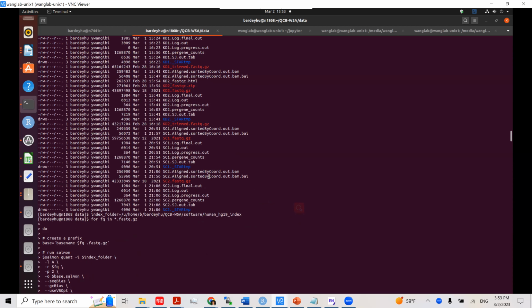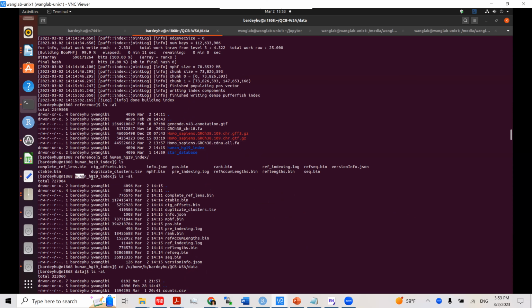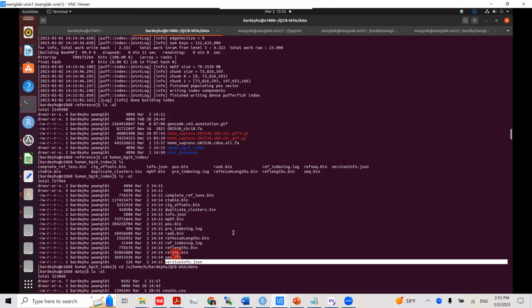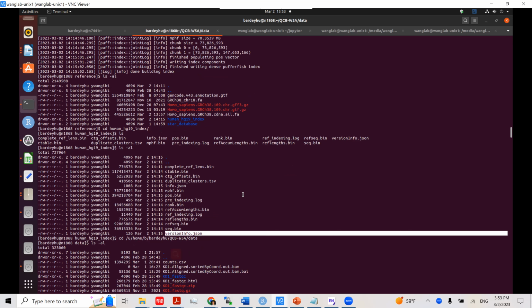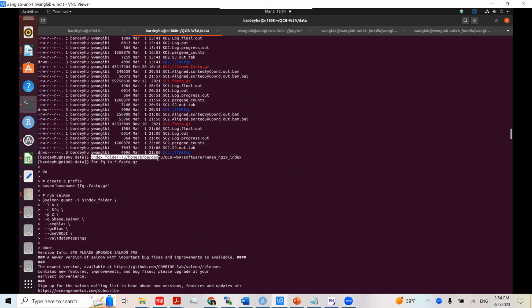You can go back to see the folder. It's here. So this is a folder, and the file is here. Oh, that's odd. Did you give it the right path all the way through? Can you go down? The path is here. Oh, it's software. So that's the thing, right? It's reference, right? Not software. Oh yeah, see, software. Got it. That should fix it. Okay. Thank you. Yeah, of course. Try it out.